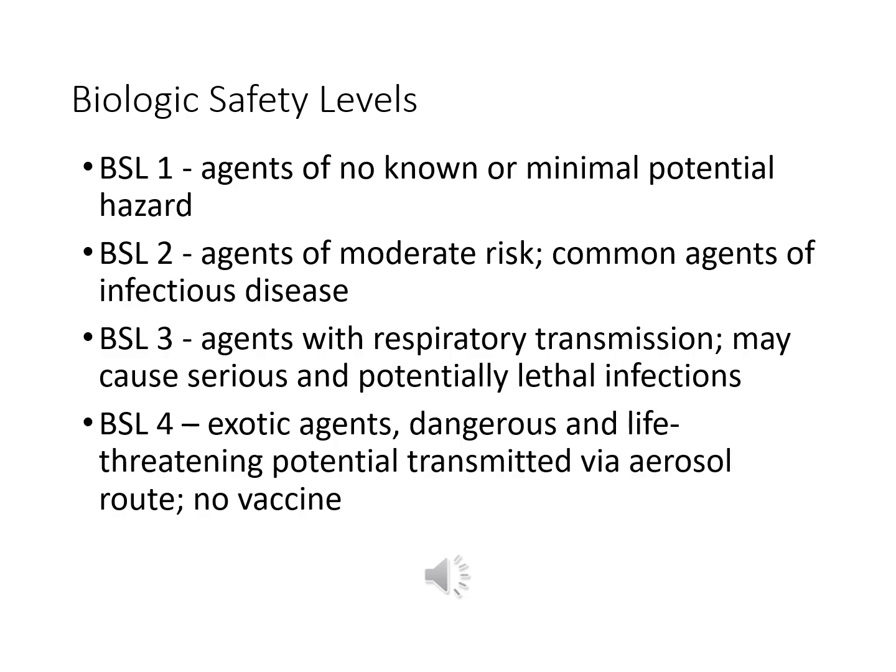And then BSL level 4 is typically not something you will see in a routine clinical lab. This is going to have heightened security and heightened PPE, so think of those lab workers in the big spacesuit-looking things. The protocols are also going to be different. These are usually exotic agents that are life-threatening, potentially transmitted by the aerosol route, where there is no vaccine available. Examples would be Ebola, Marburg virus, things like that.